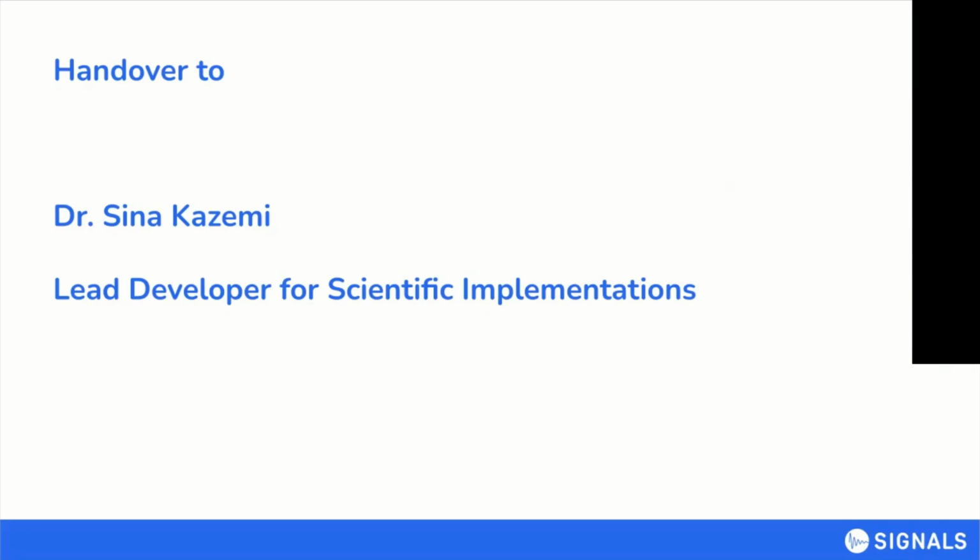So far we talked about, or Jakob talked about, a lot of the interaction you have with the software to get data in and curate the data, organize the data, that is, using the graphical user interface. I want to show you some power you get when you use programmatic interfaces. So you access the data and your structures with the program, with the code.